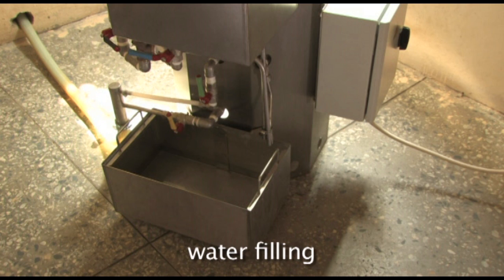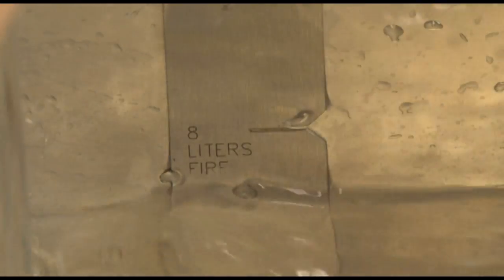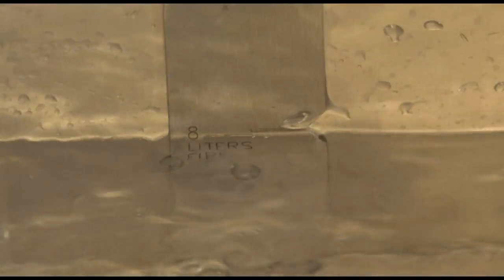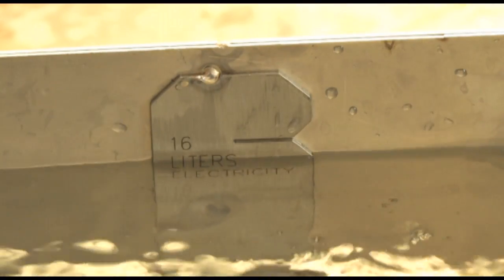You can use the bottom external tank which is detachable as a measure. It has two marking lines. The lower mark at 8 litres when heating with kerosene and an upper mark at 16 litres when heating with electricity.